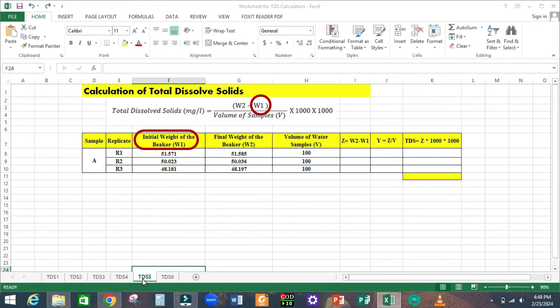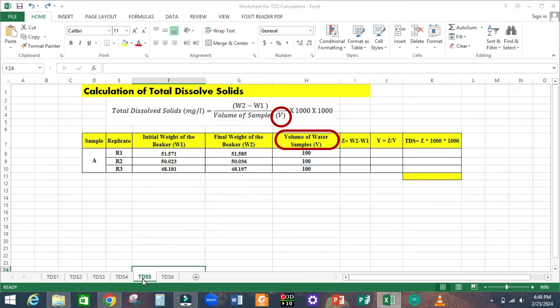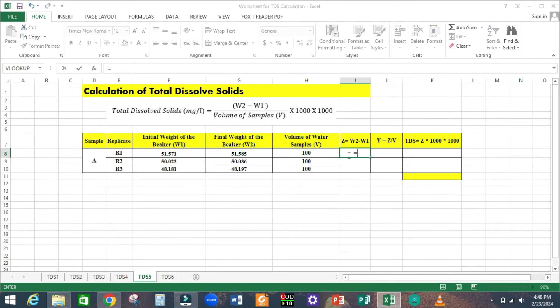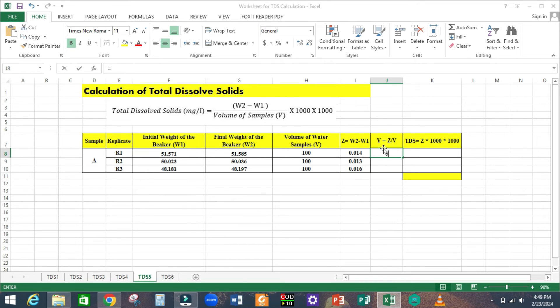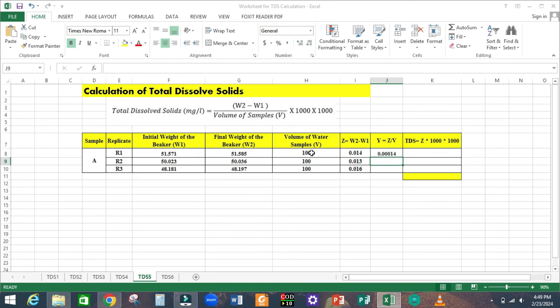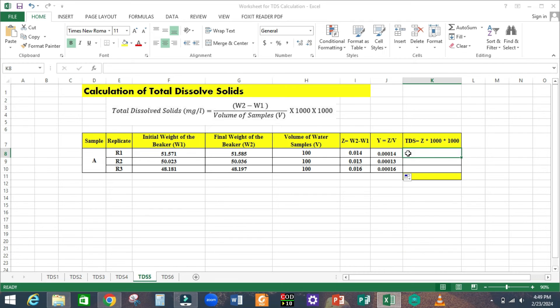We now have W1 as the initial weight of the beaker, W2 as the final weight of the beaker, and V as the volume of the water samples taken. First, calculate the numerator part of the formula: W2 minus W1. Enter the formula, press Enter, then double-click to fill down and get the Z values. Now divide the numerator by the denominator: let that be Y, so equals Z divided by 100. Press Enter and double-click to get the Y values. Now we have W2 minus W1 divided by the volume of the samples.